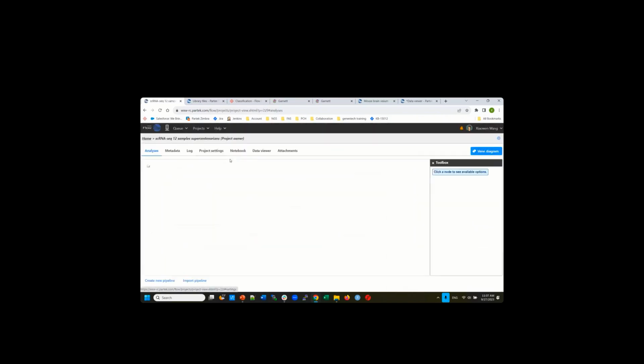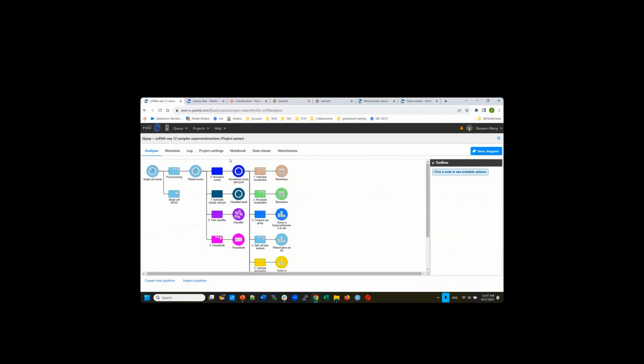But if you see some genes on the right that you defined as a marker gene of dendritic cells, but it seems not very good because they have a high overlap with another cell type, maybe you can tweak your marker genes and then rerun it. So this is one thing you can do when you use the train classifier: tweak your markers, to identify your biomarkers.